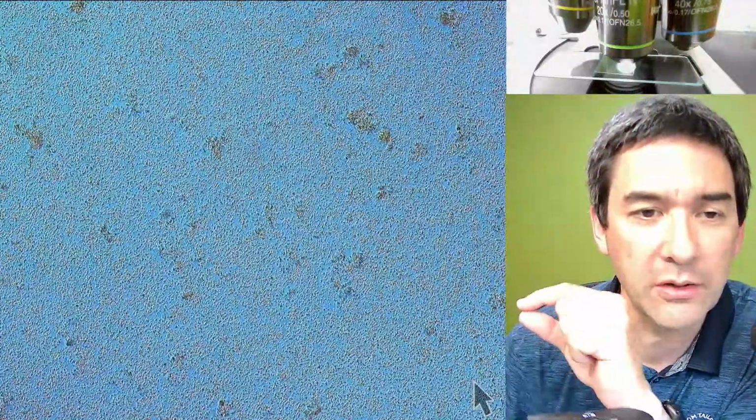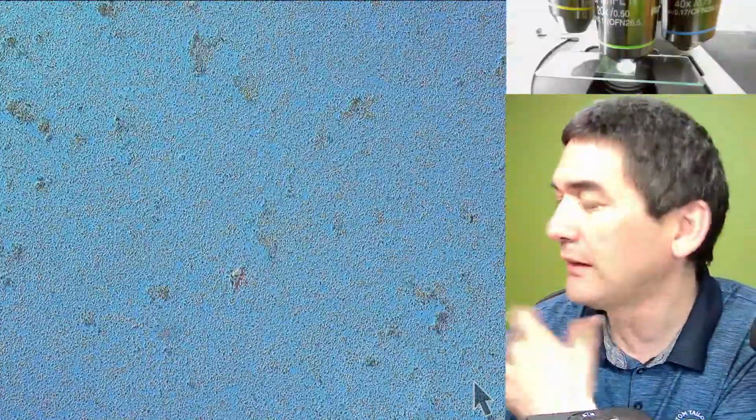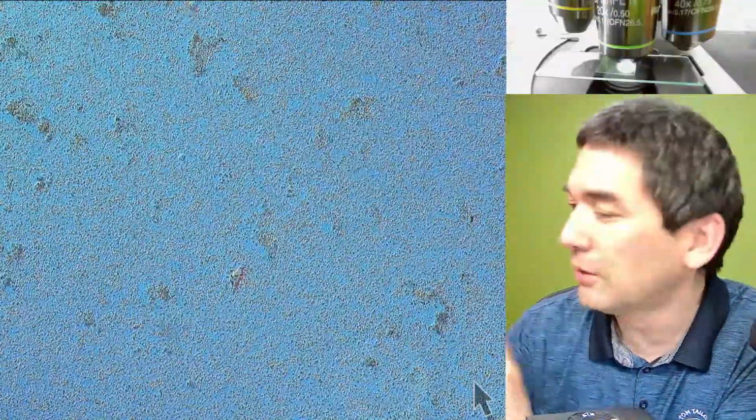Yeah, that could be indeed a ciliate swimming in another layer of focus. Yeah, that would make sense. But the layer is so thin. Yeah, it's really compressed. The problem of dark field is that I only have it at low magnification, right? So this is why we're probably not able to see a lot.